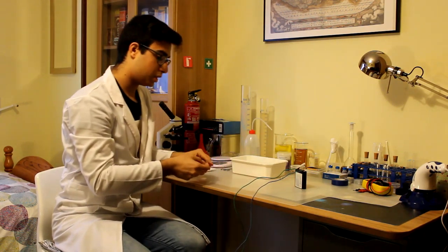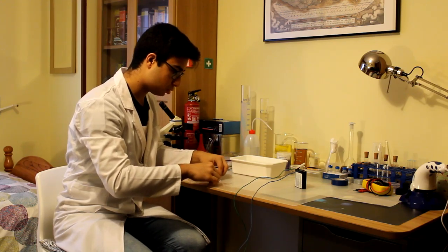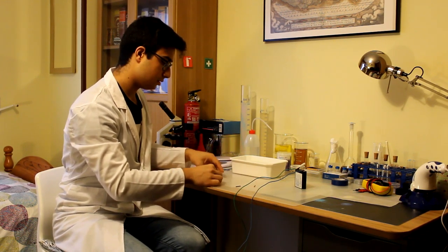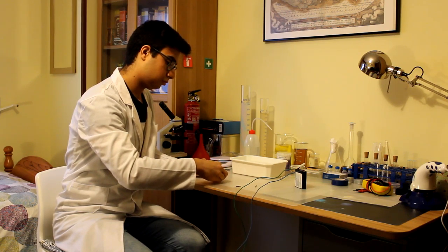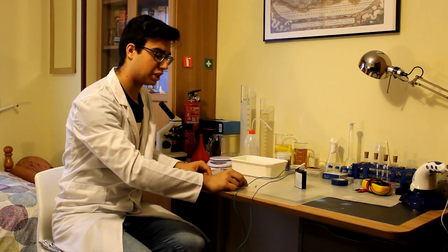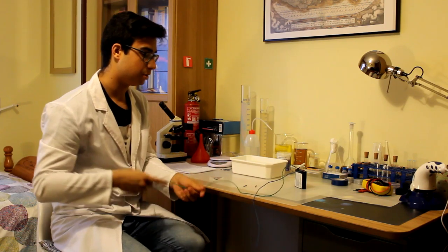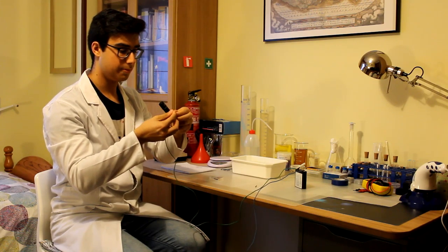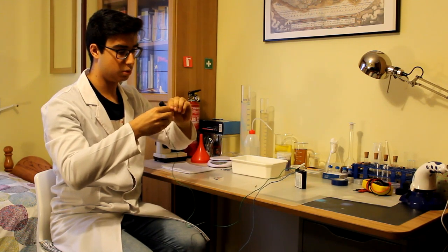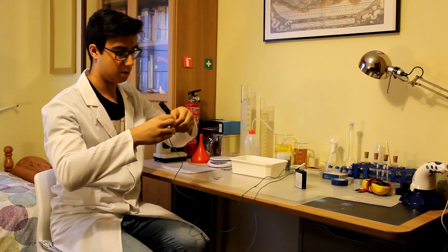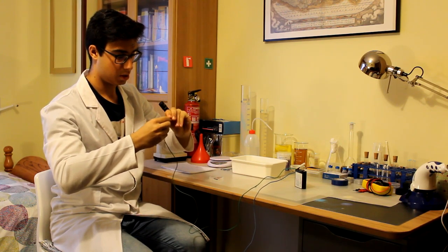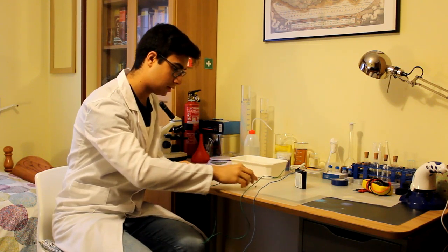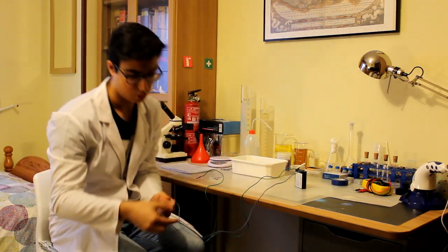Y lo que hacemos es que en los extremos ponemos un trozo de la mina de grafito del lápiz. Los trozos, pues, de unos dos o tres centímetros más o menos. Cogemos el extremo del cable y lo enrollamos tal que así. Lo mismo con el otro cable.